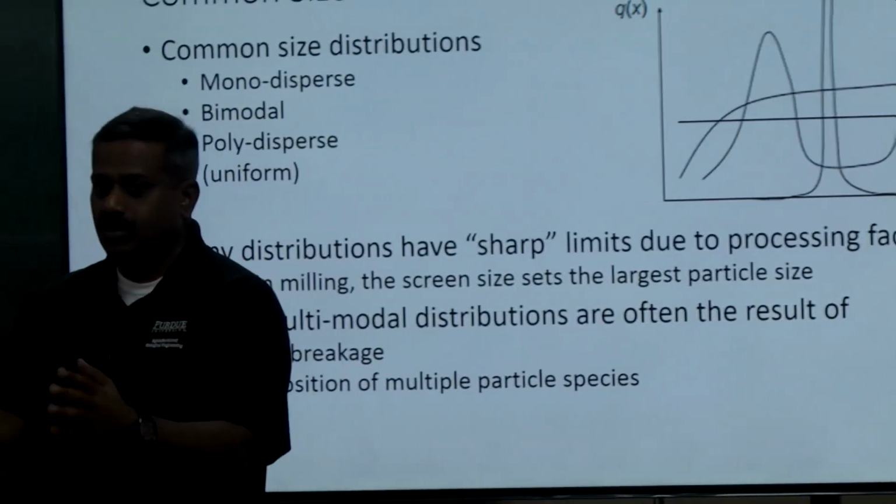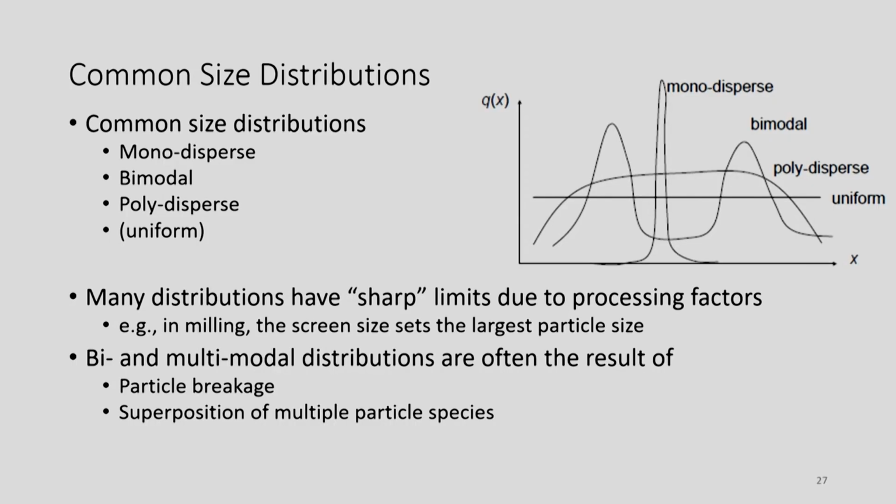For example, we will go back to the wheat flour. The starch particle sizes are 30 to 50 micron, but the overall flour will be about 140, 150 micron, right? So very commonly you get a bimodal distribution with a large number of starch particles and a large amount of protein and starch combined particles. But polydisperse is also common for any type of powder.